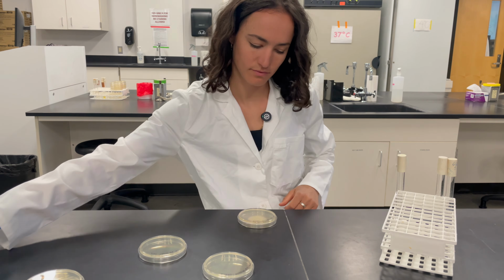You might also notice that I flamed my inoculation loop before dipping it into the petri dish to grab some of my culture. Placing the inoculation loop into the hottest part of the Bunsen burner until it turns bright red ensures that the loop is sterilized and won't contaminate my sample. The next steps are going to be heat fixing the microbes onto the glass slide. You can do this by passing it through the Bunsen burner a few times or by using a slide warmer, which in this case I did. And then we need to stain the slide for easier viewing under the microscope.